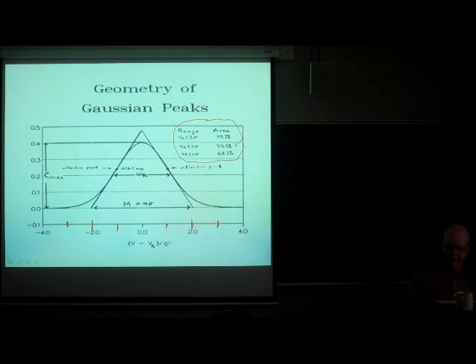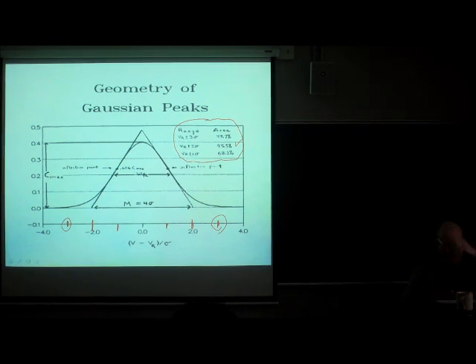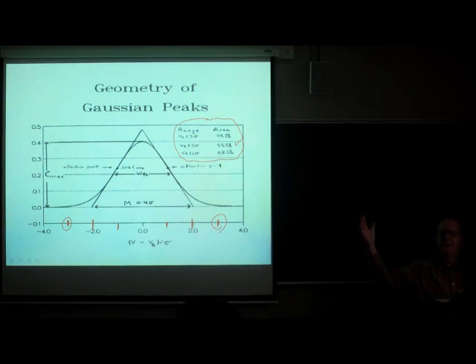Not so bad. But really, I think to talk about quantitation, you're looking at it at the 3 sigma limits. At the 4 sigma limits, the difference from 100% is so small that within experimental random error, there's no point in making your integration window go from -4 sigma to +4 sigma. That's just a waste. And what you're doing when you do that is you're acquiring baseline noise. And you don't want to acquire baseline noise.